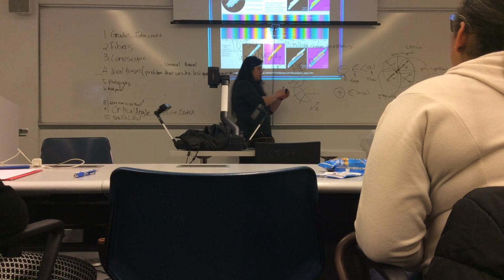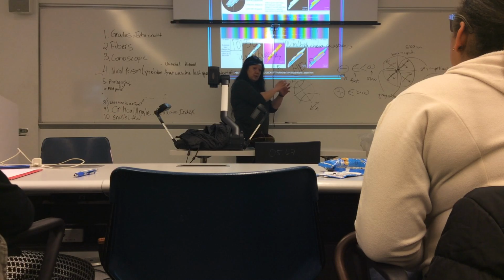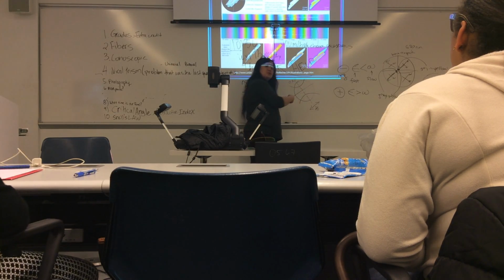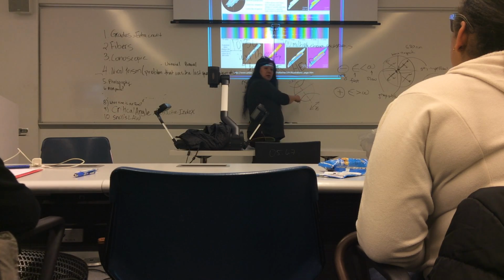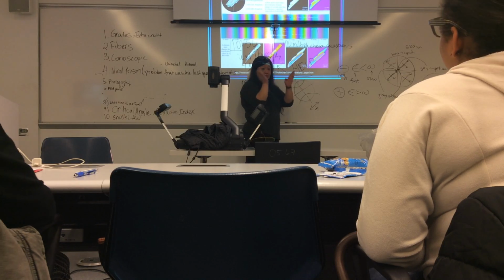I will orient my centered conoscopic interference figure such that I have the brushes or the isogyres in the second and fourth quadrants. If I rotate that, then they go back to being across.